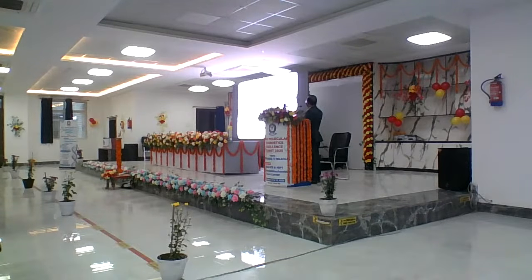Again the same thing: no targets, low targets. Here you have, let's say, 143 droplets, and at low concentration we have 6 of 143, but using Poisson statistics, the corrected count comes to around 6.2, just similar to that. In the medium concentration, around 34 is there. If you apply Poisson statistics, it will give the corrected value as 38. Whereas in high concentration, you see 70 are there, but on correction, it gave a higher value of 96. So this is how Poisson statistics helps you quantitate the absolute numbers.